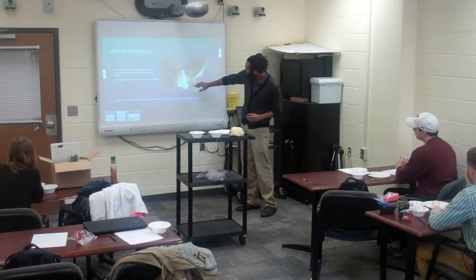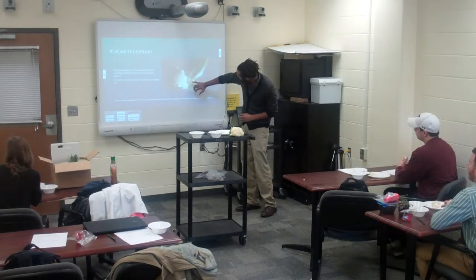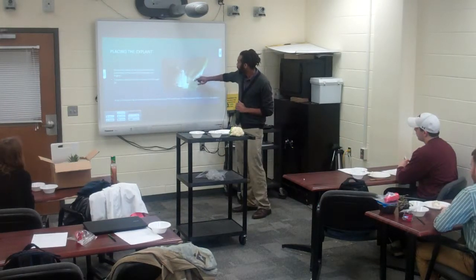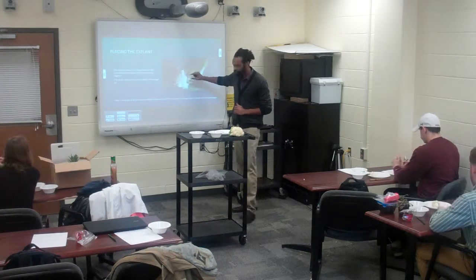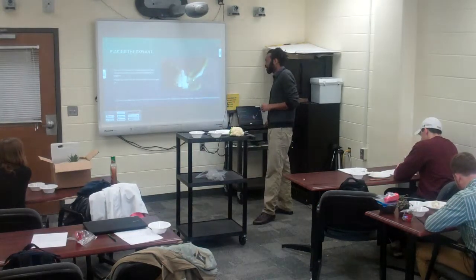This is a picture of a cauliflower. You can see there are some leaves coming off, and you can see there are roots underneath the agar, which the picture's not really focused on, but you can tell. And this right here is inflorescence, which is kind of what I'm talking about. I mean callus. I'm sorry.